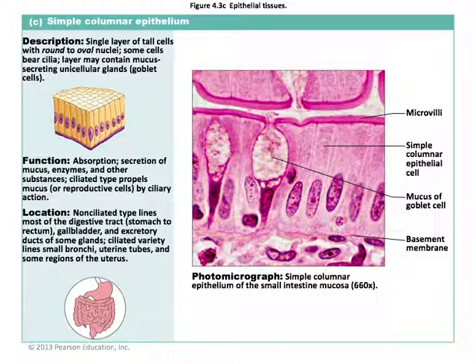All right, the next layer up, no surprise here, would be simple columnar epithelium, the one that is left. This is a single layer of tall cells. You can see here, in fact, that the nuclei do look quite long. This is not what I oftentimes see, but this is a nice way to identify this particular cell. Man, this looks just like the sketch here. I mean, take a look at these cells. Here's 1, 2, 3, 4. You see all of their nuclei. They are quite long. They look just like the sketch over here.